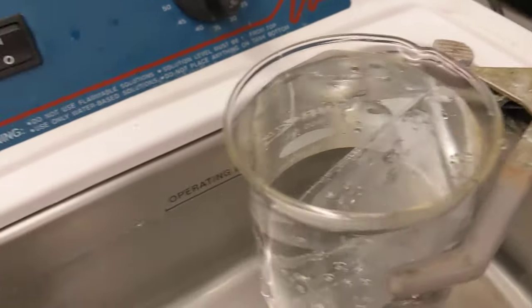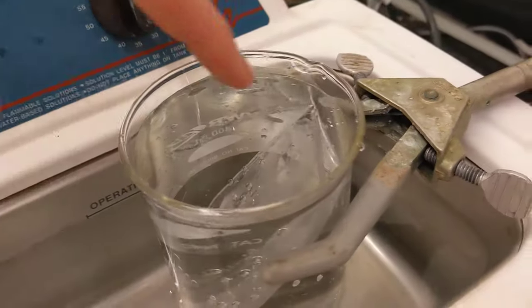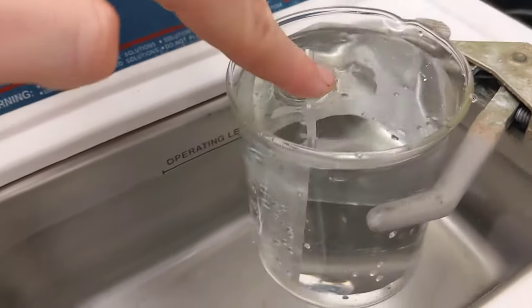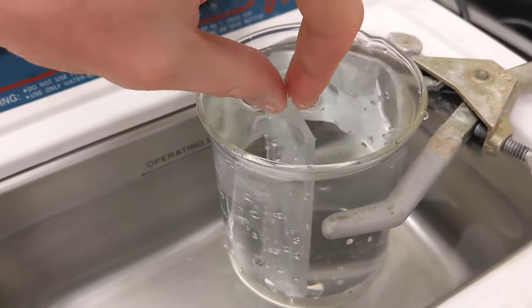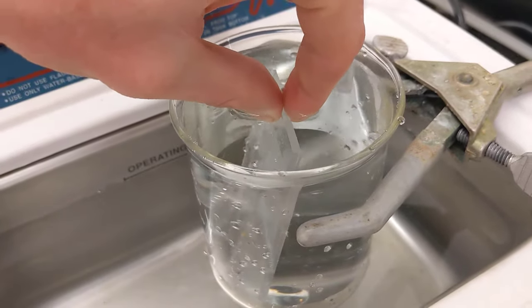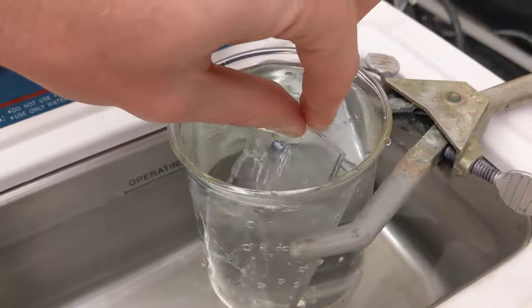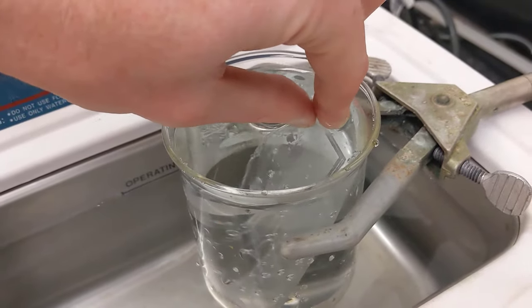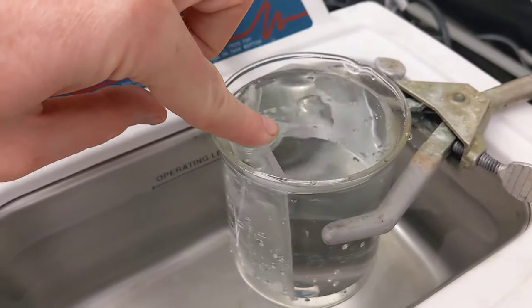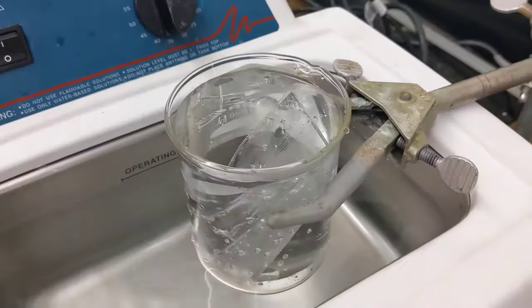You also want to be especially careful that you don't have too many objects inside that you want to clean. When you turn the unit on, if you have several chips in here, they'll tend to stick to each other, and the faces that are stuck together won't get cleaned as thoroughly. It's better to use some sort of divider or to clean chips individually.